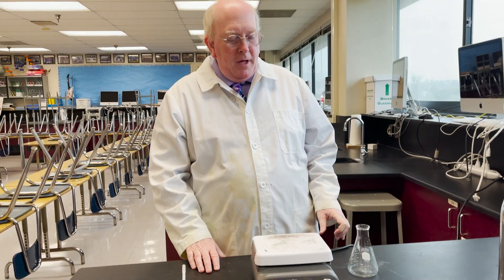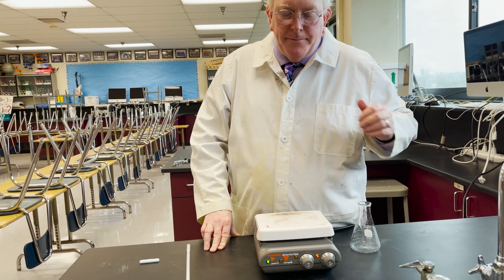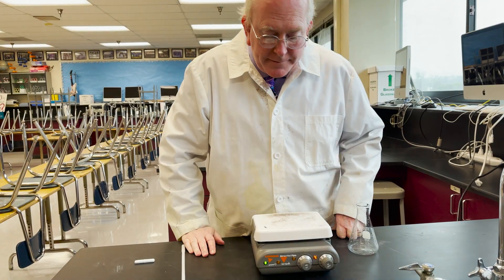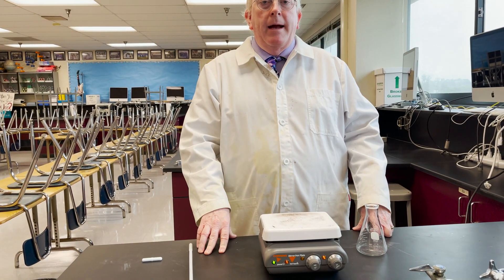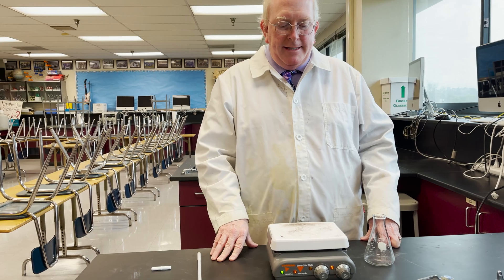Now to use it as a hot plate, all you have to do is turn it on and you will see it light up indicating that it's heating. It takes a few minutes and it's got a range of settings. Follow whatever laboratory instructions you've been told to follow for how high to set it.